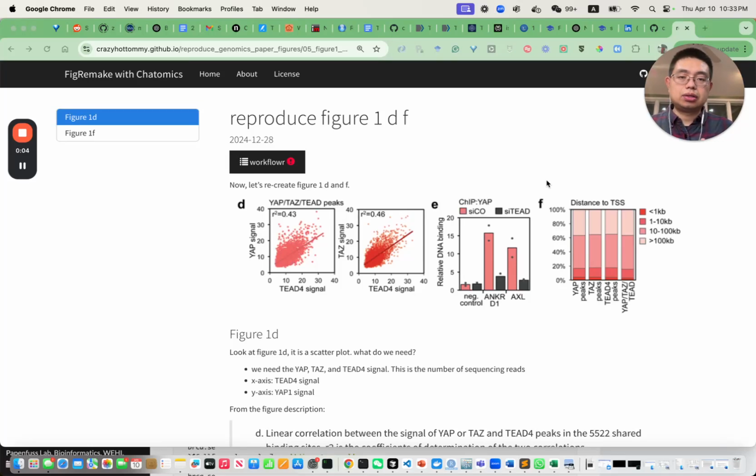Today we will continue to replicate figure 1 of a genomics paper. So make sure you watch all the previous videos in this playlist so you understand what the project is about.